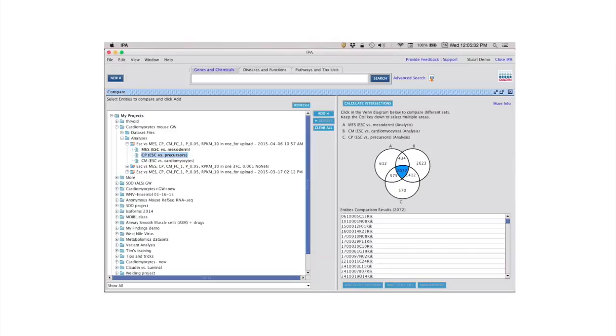If you upload data that represents the comparison of 2 groups with fold change, how are you making additional comparisons with heat maps? An analysis in IPA really operates at the level of fold changes. Say I'm comparing tumor to normal, and I have a ratio of tumor to normal. That gives me fold changes, and that's one analysis.